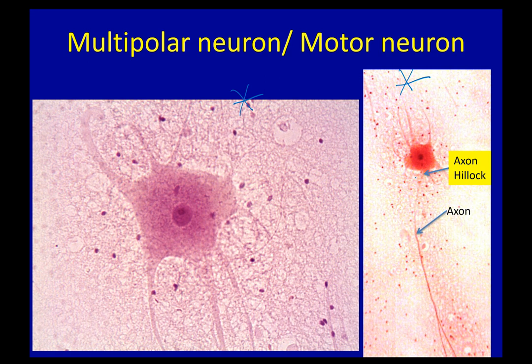So looking at this picture, you can see the long extension coming off of the cell, the soma, the cell body. In that case, that's the axon. Neurons only have one axon, period, end of story. So if you can see where that long extension is, you know that's the axon. From this picture here, you don't know because I haven't given you enough information. So for what you can see in this picture, your thinking should be all of them are dendrites because I haven't shown you which one is the long extension coming off of it.